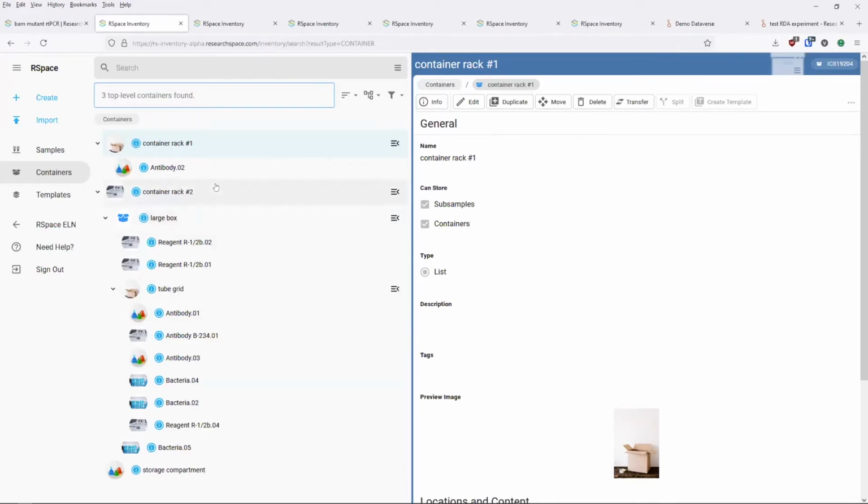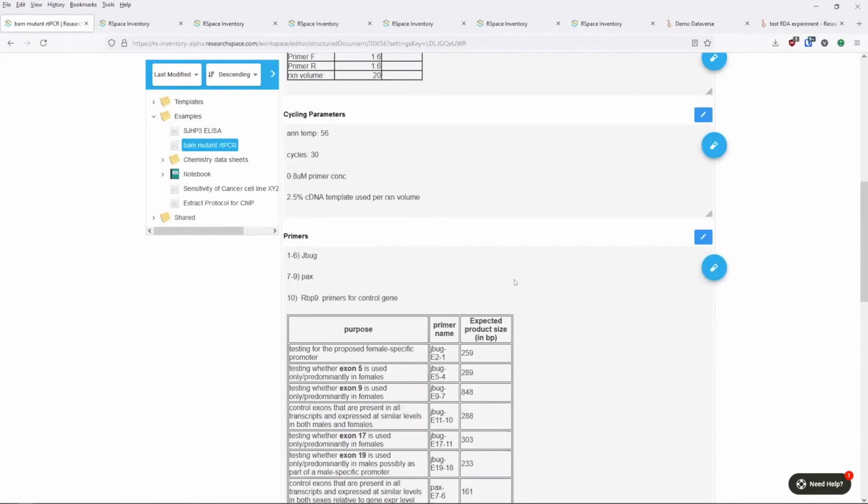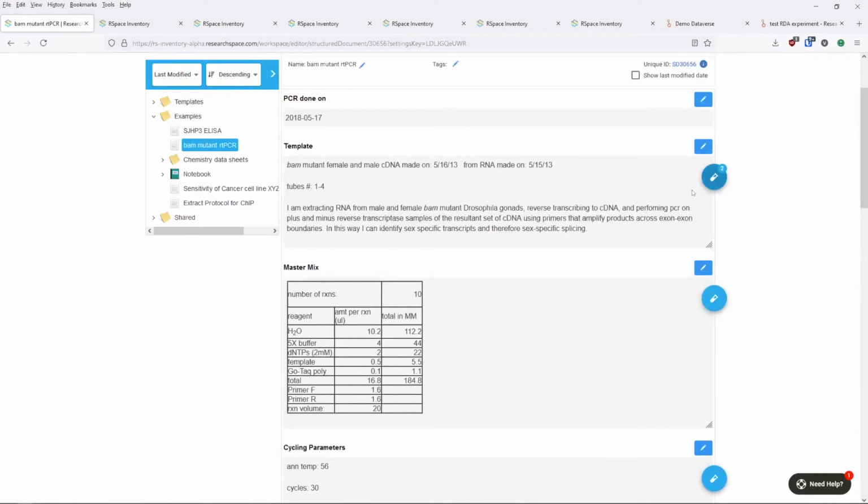So that was very quick, but now let's switch over to specifically the ELN. Here we've got an ELN document, just pretty classic. You've got some fields, we've got some tables, some entries. Now notice on the right-hand side here, we've got little inventory icons. If you click on one of these icons, you'll access the list of materials. So the ELN integration is really about enhancing reproducibility by making it possible to include reliable data about the samples used in the experimental records.